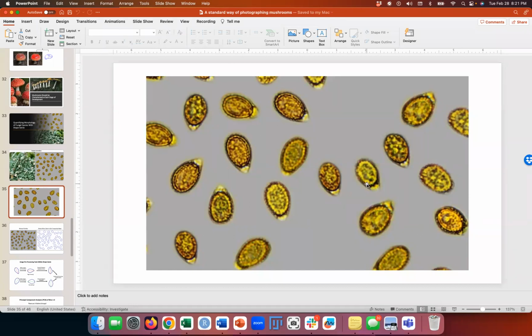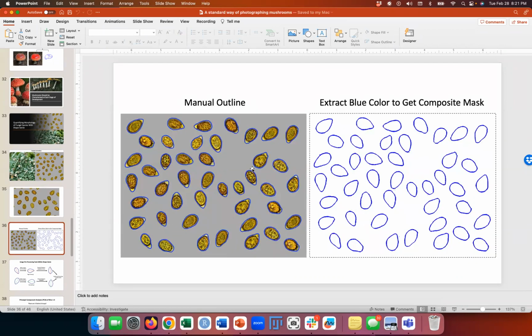To me, I think subpopulation, okay? And so to start, I just wanted to measure the shape of the outer contour of each spore. So here I just manually trace the outline, all right? You can also do it computationally, right? And in Shape Genie, I then extracted the outline of each of these spores, and then I isolated each of them onto their own canvas, the white canvas.